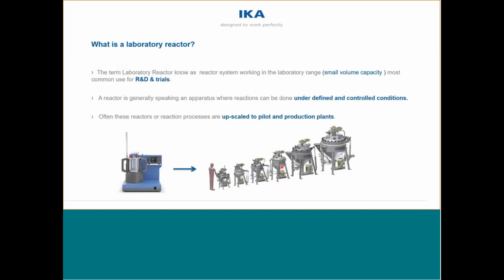So what is a lab reactor? A lab reactor is basically a reactor system at lab scale, commonly used in R&D trials. You can control all the parameters inside the system. And you can see from the outlook of the reactor system that it is mimicking the process plant. So when you want to scale up in the future, the changes required are actually very minor.